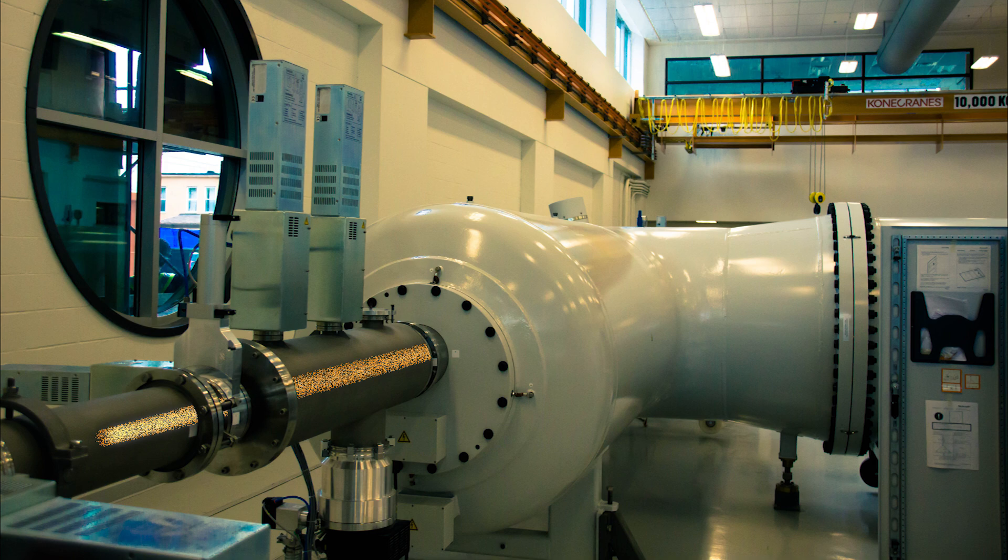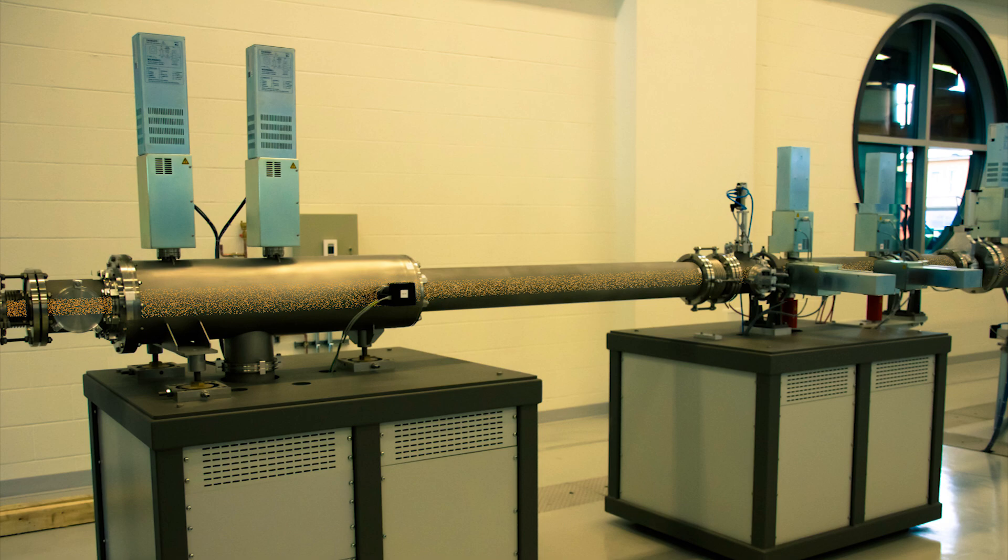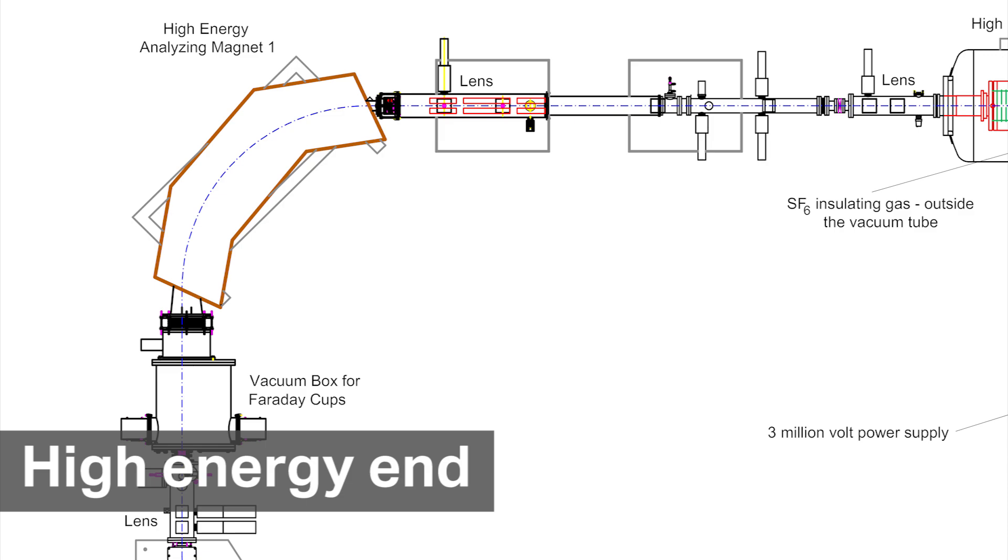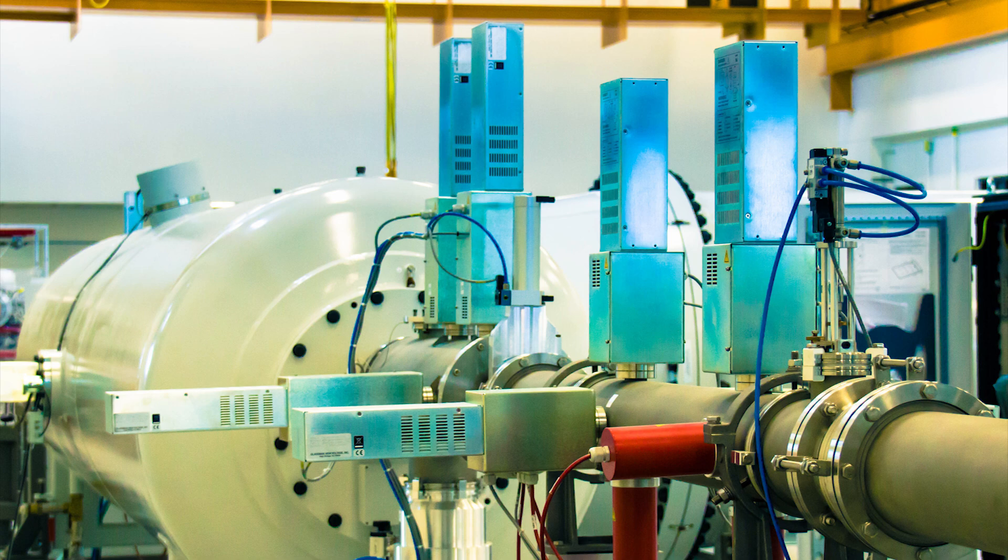It's going to shoot them out the other end. Now we're going up to a few percent of the speed of light. Our ion beam is really rocketing as we're walking over here now to the west side of the machine. We're at the high energy end. Our ion beam is racing out as the flight path goes into a magnet, and we've got a few control centers along it. These are electronic lenses so we can change the shape of that beam.